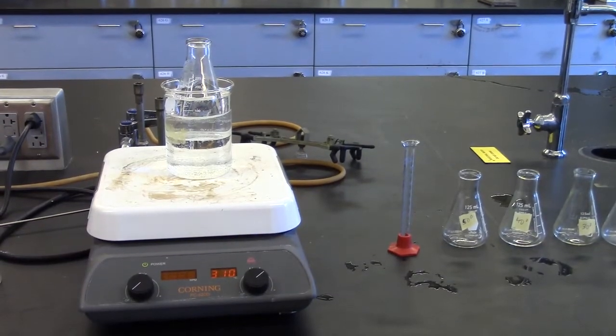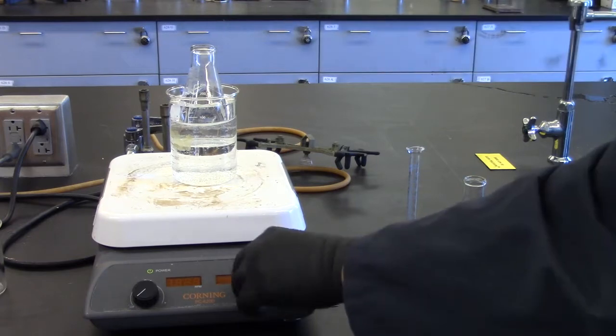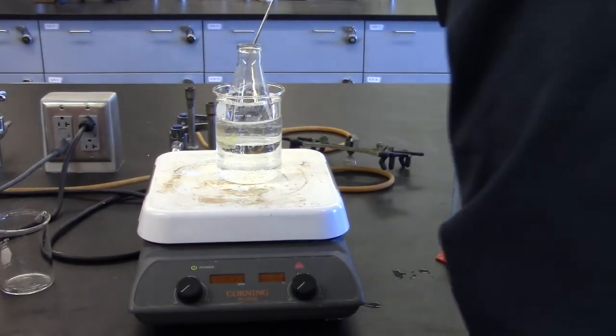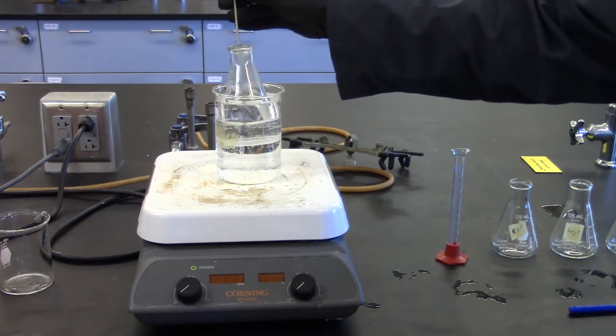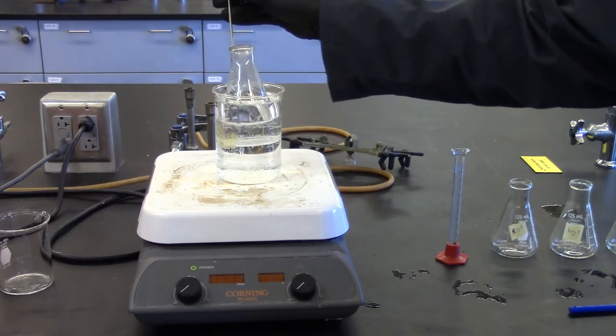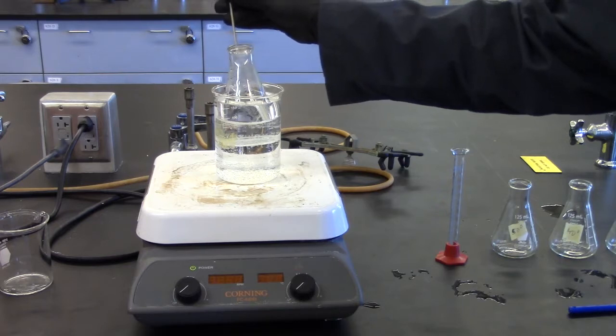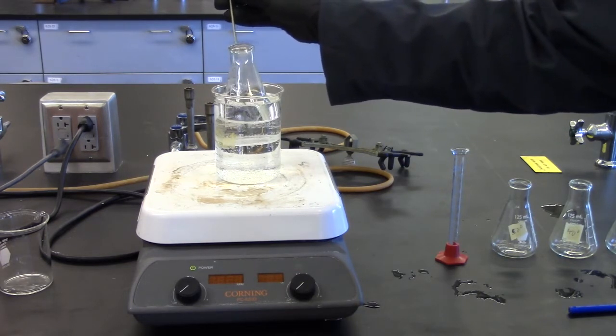For this next part, you will use the main flask that contains the dissolved borax. Turn off the hot plate and place the thermometer into the main flask. Leave the flask in the bath and allow the temperature to drop slowly to 52 degrees, stirring constantly. Once the temperature has reached 52 degrees, stop stirring and allow the solid to settle on the bottom of the flask.